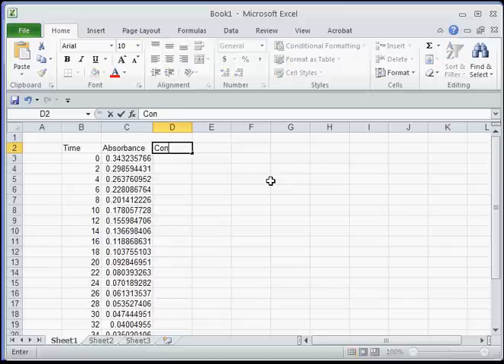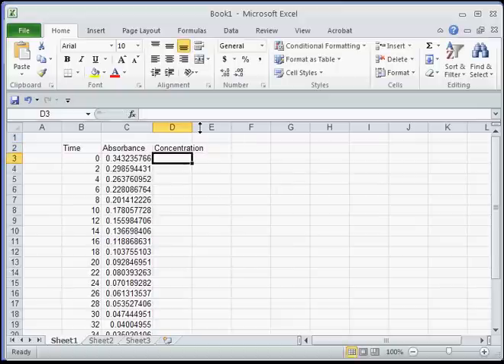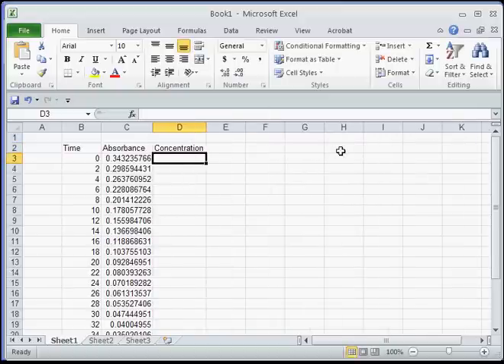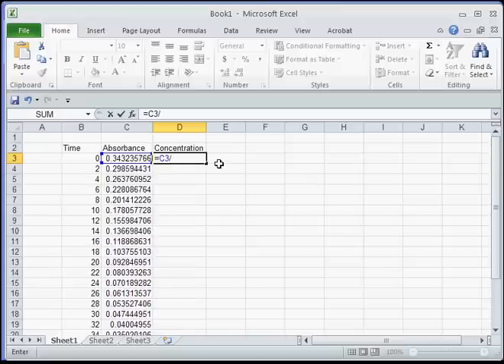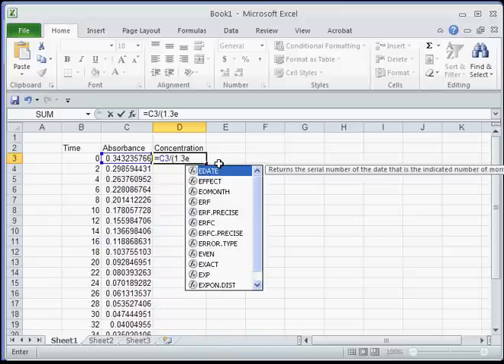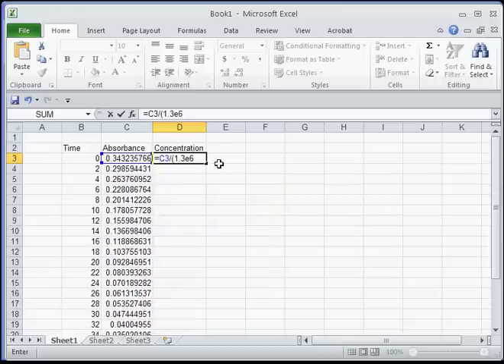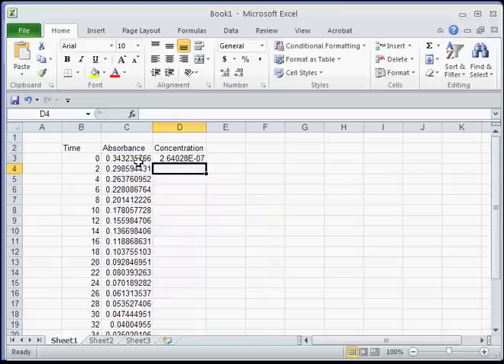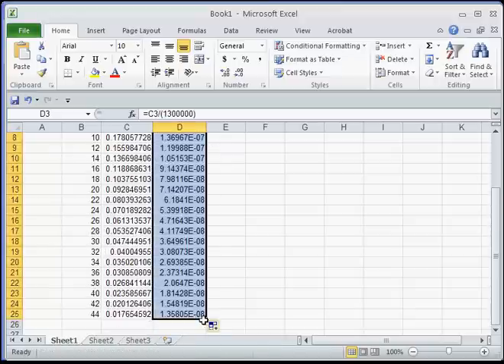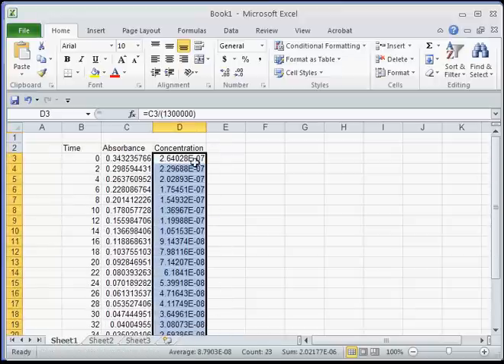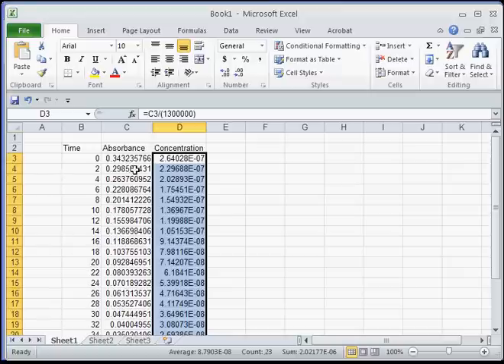The concentration, we use the Beer-Lambert law. And I will type the equation in, but it's equals absorbance divided by epsilon and beta or E and B. The product of those two numbers, B is actually one. So we don't usually include that. It's going to be 1.3 times 10. You notice I use E to get my exponent to the sixth. Hit enter. So that's the molarity. And then I'm going to drag this down. And so these are concentrations of the reactant. And these are the absorbances. And these are the times.